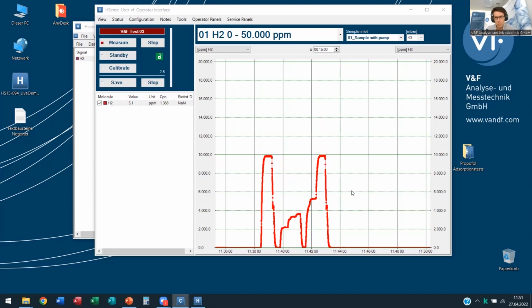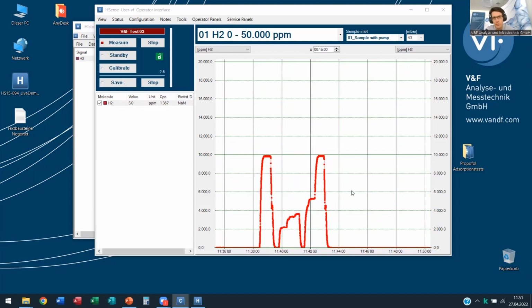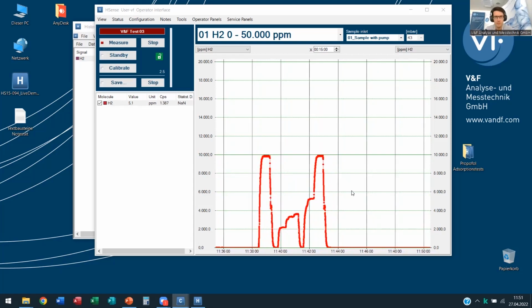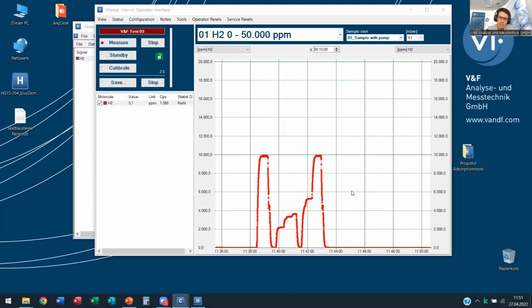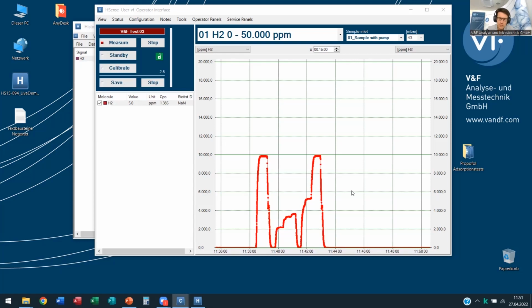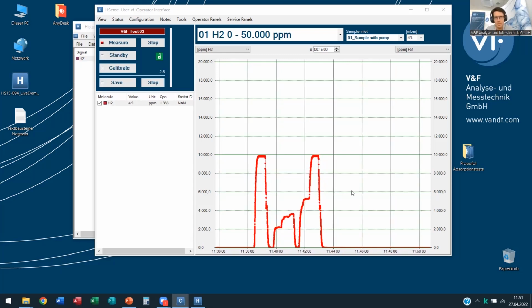When the instrument arrives at my department from production, we are going to set up all the ion optics and lots of parameters, and then we are running a measurement protocol. So we are checking the instrument for linearity, stability, accuracy, precision, T90 time, and depending on the application and the customer's needs, additional tests can also be done.